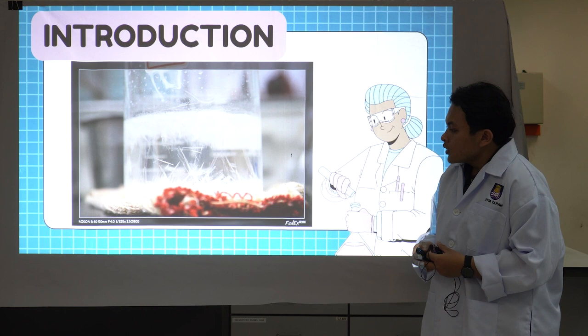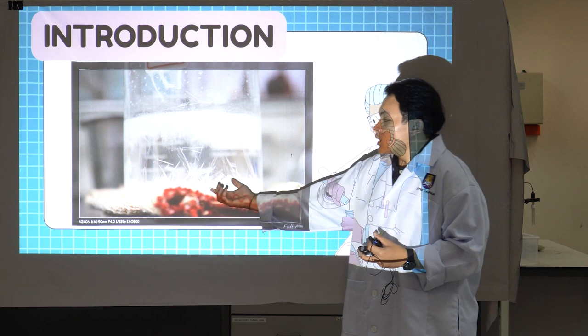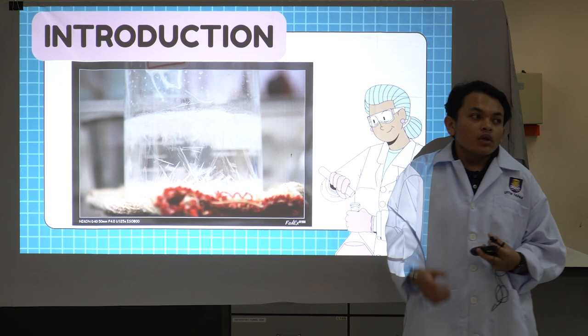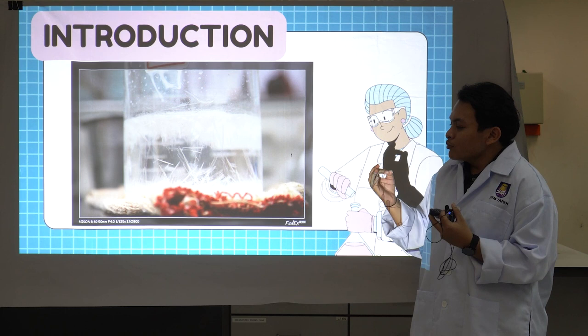For the cooling process, we must cool it slowly when we want to get long-shaped crystals. Otherwise, we get shorter-shaped crystals, and shorter ones we must handle more carefully. Okay, that's all for me. I pass to my friend.